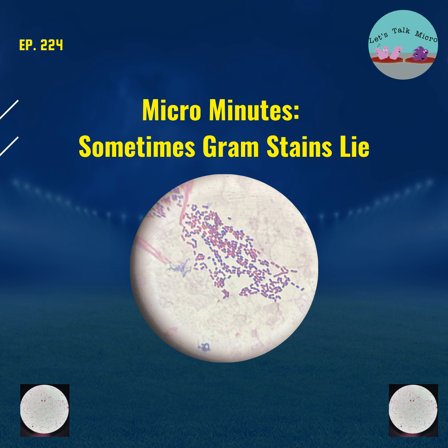Okay, so moving along, to stay in the spirit of the 10-minute episode, something that can affect your staining, of course, is your decolorization, right? That's a very important step, and it's one that takes a long time to master. And even then, you still mess it up sometimes. So always be careful. And with the procedure, it says you add decolorizer for 3 to 5 seconds.